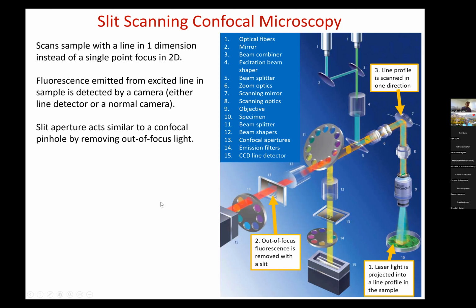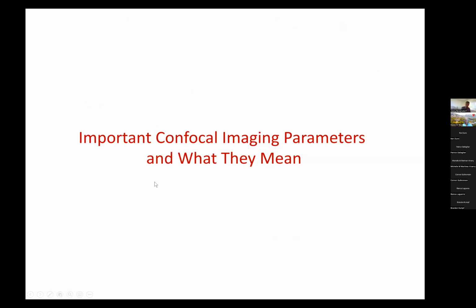Okay, so that's enough about the underlying optics technology here. I want to spend the remainder of my time talking about the parameters that you as a user can control on your confocal microscope, where you actually have power over, and where you can also mess up your recording if you don't understand what you're adjusting here.